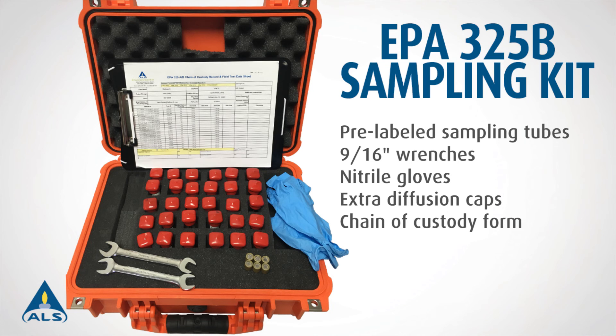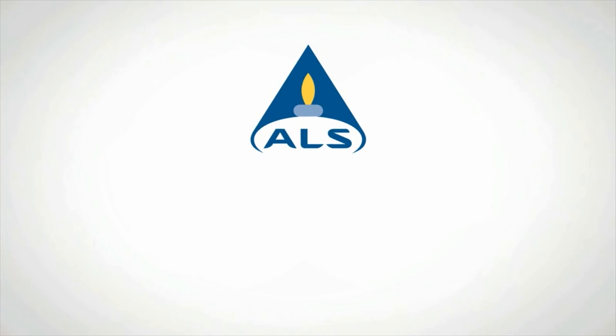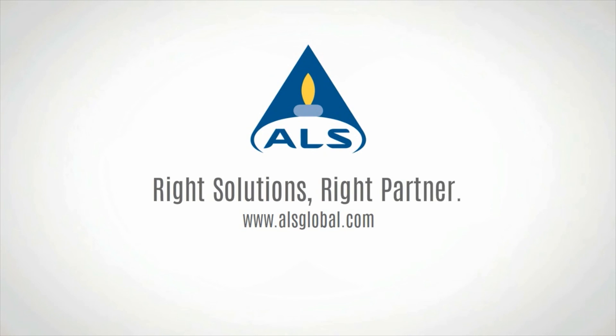In the field, the sampling kit contains everything necessary for successful sample deployment and collection, including wrenches, gloves, additional diffusion caps, and the chain of custody form paperwork. For any additional information, please contact your ALS project manager or visit ALSglobal.com.